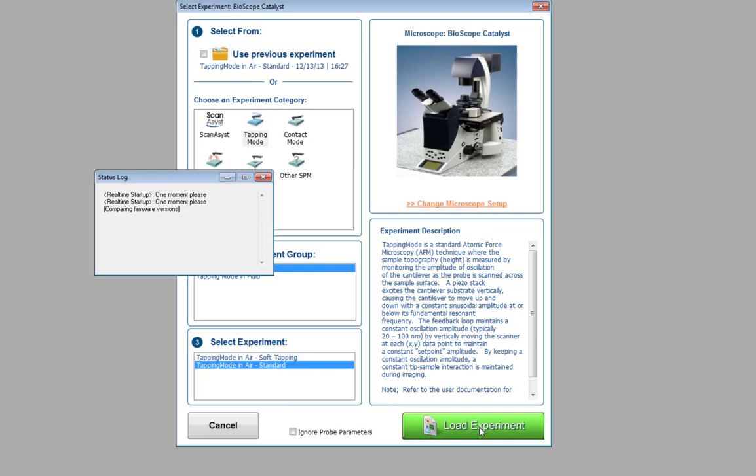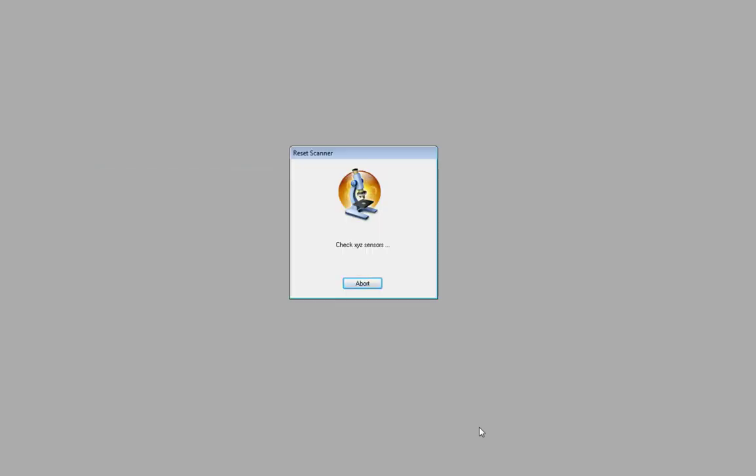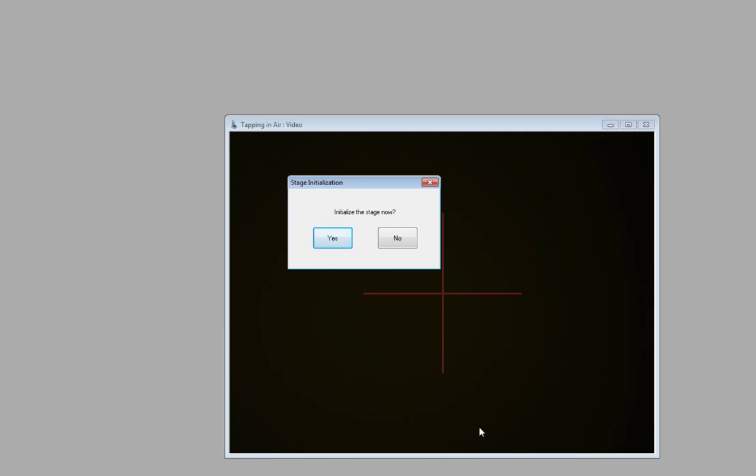The first thing it's going to do is connect to the instrument and start booting everything up. It's going to ask us to initialize the stage, but we're actually going to wait on that. If we haven't lined up the laser on the cantilever before we initialize the stage, it's going to give us an error. So we're going to wait on that part.